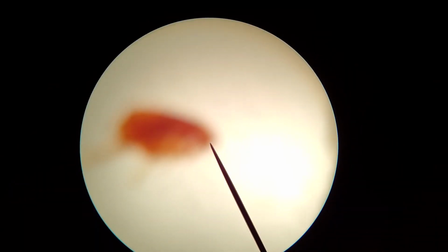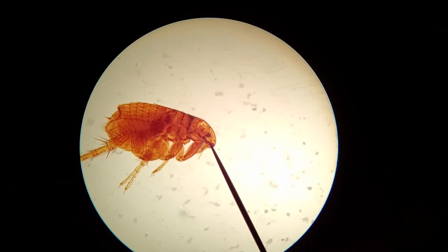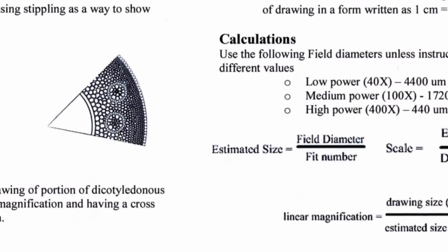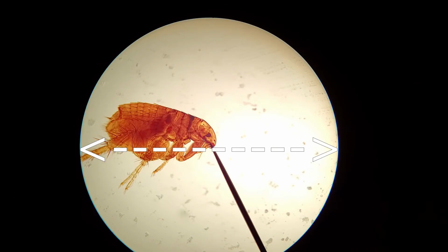Knowing our field diameter gives us some perspective of how large the objects in our field of view are. This allows us to estimate the size of these objects by guessing how many of the objects would fit side by side, called the fit number, and dividing the field diameter by the fit number. This is a very subjective thing to do, and it requires you to do a little bit of guessing, but it also gives us a general understanding of the perspective of these objects. The equation for estimated size can also be found on page 3 of your data booklet.